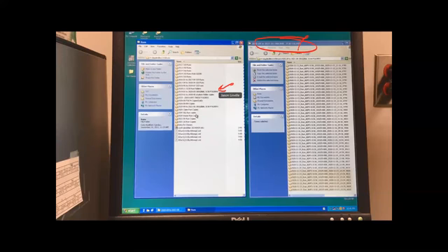But in the same run folder, you're going to notice that you're creating one specifically for your files. So we have JGL up there. Who else? Claire has a folder. Stacy has a folder. I think for Kiana, I think I made one for hers. And then is that also Haley's in there? So everybody's going to have their own. If you don't have it yet, you can make a new folder and create one in here. So it's just one level up from where those original folders are.